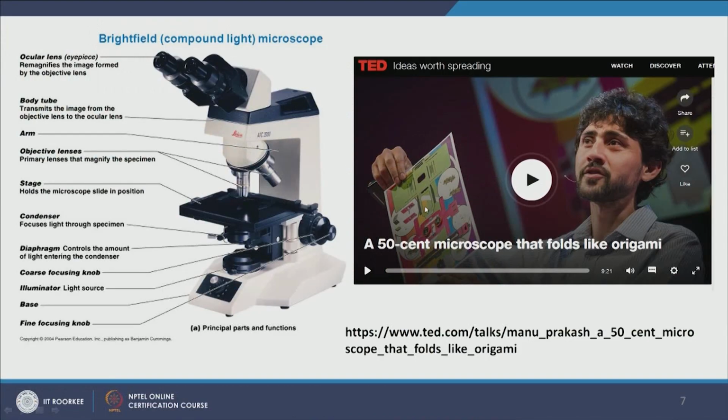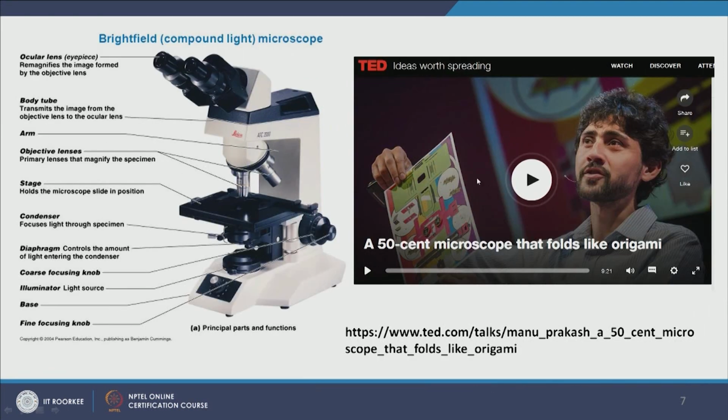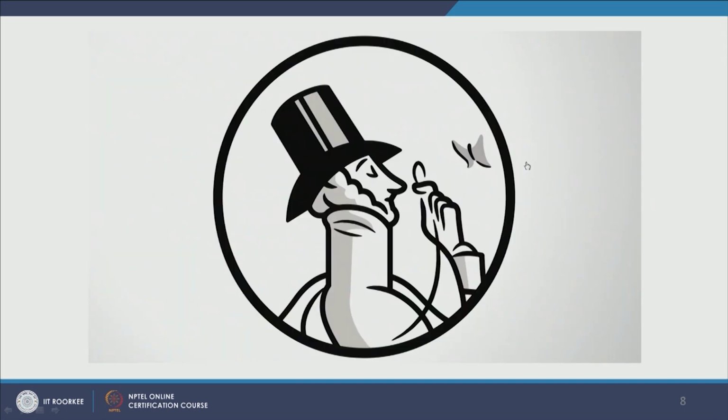This is very, very helpful for detecting pathogens, and I think this is where, in my opinion, our environmental microbiology science is headed. We want to couple the high advancements that we make in state-of-the-art labs with very accessible sensors, accessible technologies that on one hand prepare us to understand our environmental microbiology better and give us solutions, and on the other hand help us monitor robustly, rapidly, for a fraction of the cost. So here is the video on Dr. Prakash's microscope.